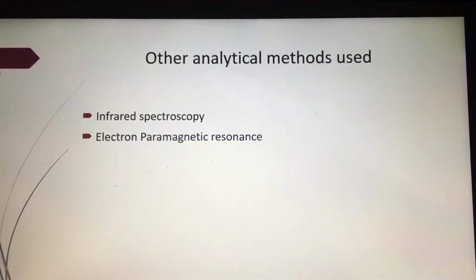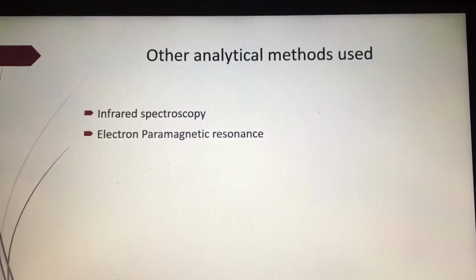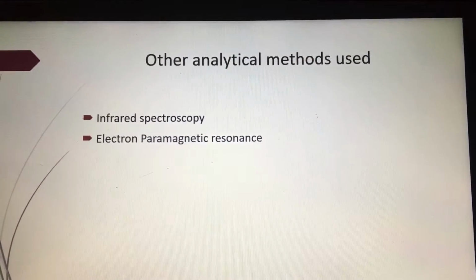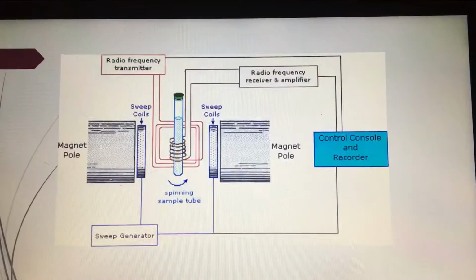NMR is joined by other tests like infrared spectroscopy, using a Fourier transform, and electron paramagnetic resonance, being great processes to show the characteristics certain chemicals have in random samples, and even being able to identify them. These processes were identified in the lecture for thermoplastics at Pittsburgh State University.